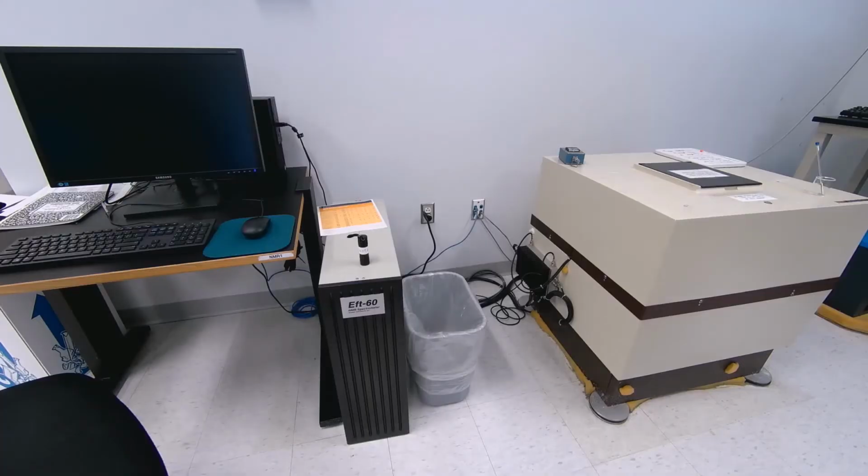So this is the NMR room. It is across the hall from the organic lab. I just wanted to show you the spectrometer. On the right is a box, that's the actual spectrometer. We're going to put our sample inside it, and it's controlled by the computer on the left.